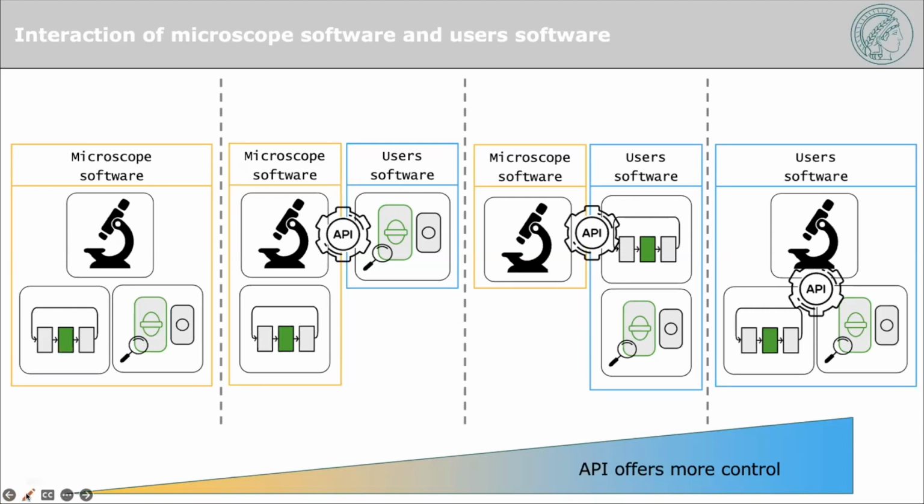So I typically like to work more in this range, where in fact we use a lot of the tools that are already in the microscope software, which gives some advantages because the users can choose the appropriate settings for the imaging. I don't have to program it somehow ad hoc, and they can choose, you know, low laser, medium laser, high laser, with some heuristic that they think is important. And then in the other part of the software, we just switch between the different imaging settings depending on some decisions made by image analysis.